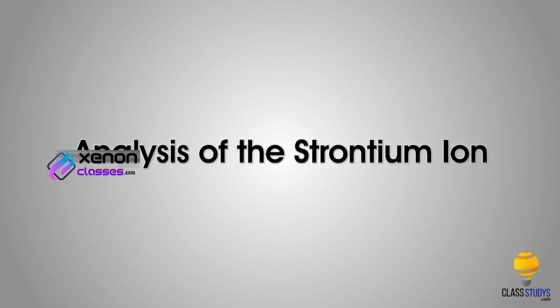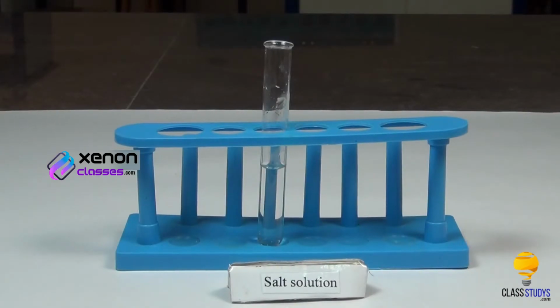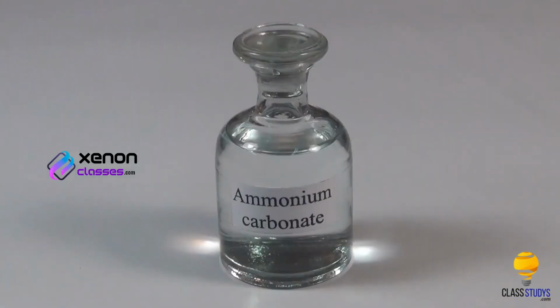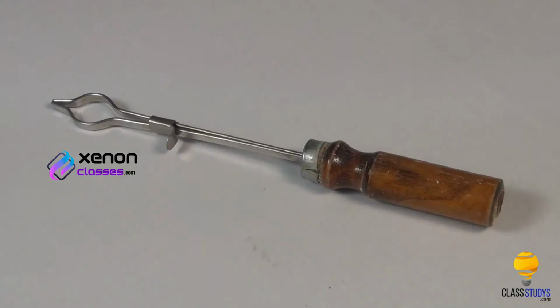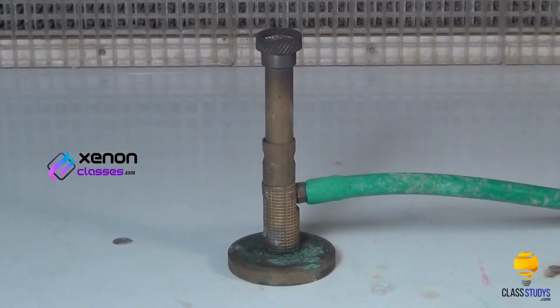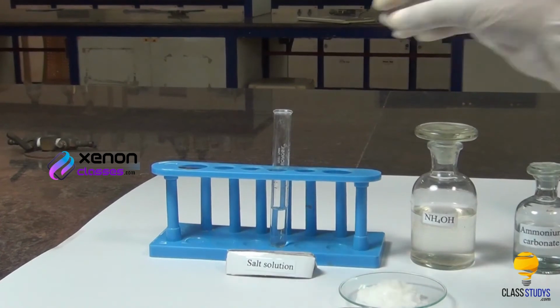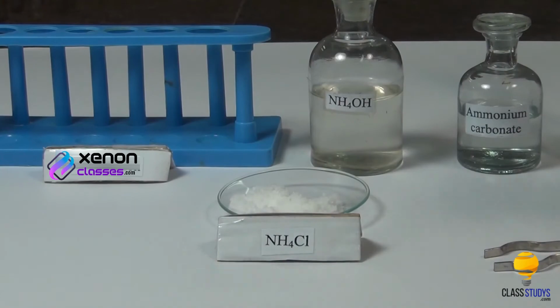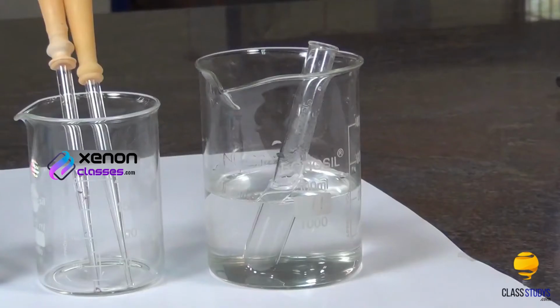Next, we look at the analysis of the strontium ion. Materials required: salt solution in a test tube, ammonium chloride, ammonium hydroxide, ammonium carbonate solution, droppers, spatula, test tube holder and Bunsen burner. Procedure: take a small quantity of salt solution in a test tube. To this, add a small amount of ammonium chloride using a spatula. Heat the test tube over the Bunsen burner and cool.